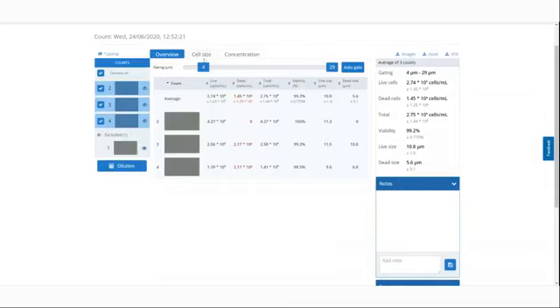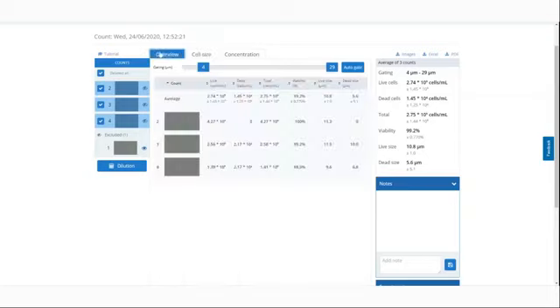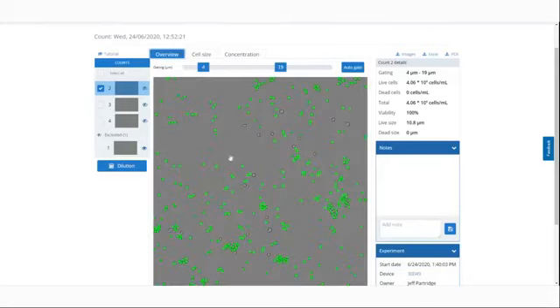So other things you can do too, this actually has live gating. You can see you've got error bars here. You can actually look at your counts. And then, for example, let's say I don't trust this count right here. I can actually gate down until it goes away. So I can say, well, okay, 24, these probably are not cells that I'm interested in counting anyway. You can actually verify that with your population. You may wish to cut the tail off there, and then you'll see exactly what the results of the live gating were. So again, that's multi-count, that's live gating, and you can also exclude.